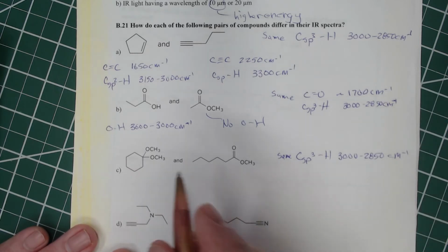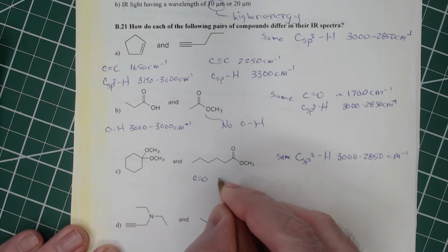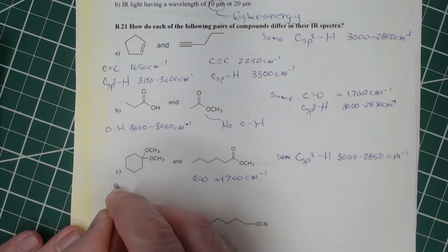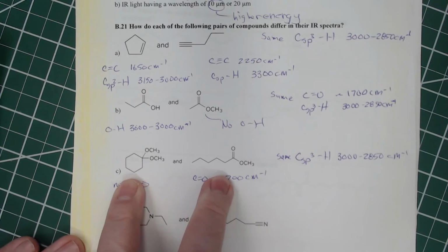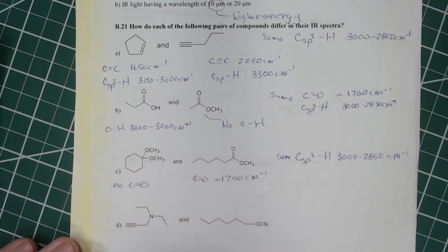As far as what's going to be different, well, this one will have a carbonyl stretch at about 1700. And this one will have no carbonyl stretch. And that will be the easiest way to distinguish between those. This one has a carbonyl, this one doesn't.